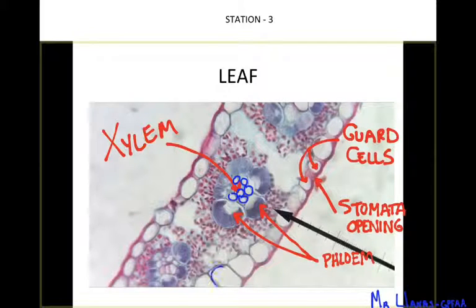If you look at these cells down here, all of them are touching, all of them are connecting, okay? Except these two, right? So these two actually have some type of opening here. And that's where the stomata is, right? So these openings right here are called stomata, and what they do is they open and close to release or exchange gases with the outside environment, oxygen and carbon dioxide, right? Water leaves through there as well.